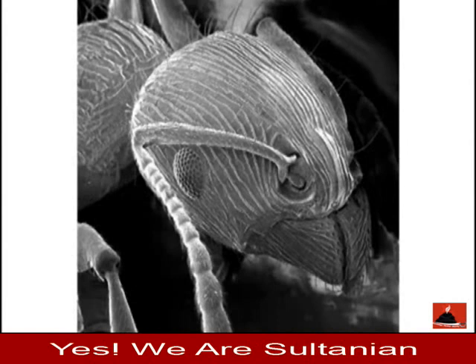So a scanning electron microscope basically fires a beam of electrons, and then they're reflected off the surface. This is used to look at things that are too thick, where the electrons wouldn't be able to pass all the way through. So you can see this lovely image of an ant's head. Electrons have been fired at it. They bounce or reflect off the surfaces there, and that can be analyzed to produce an image. So we essentially see how the electrons have bounced off, how they've been reflected, in order to produce this image.